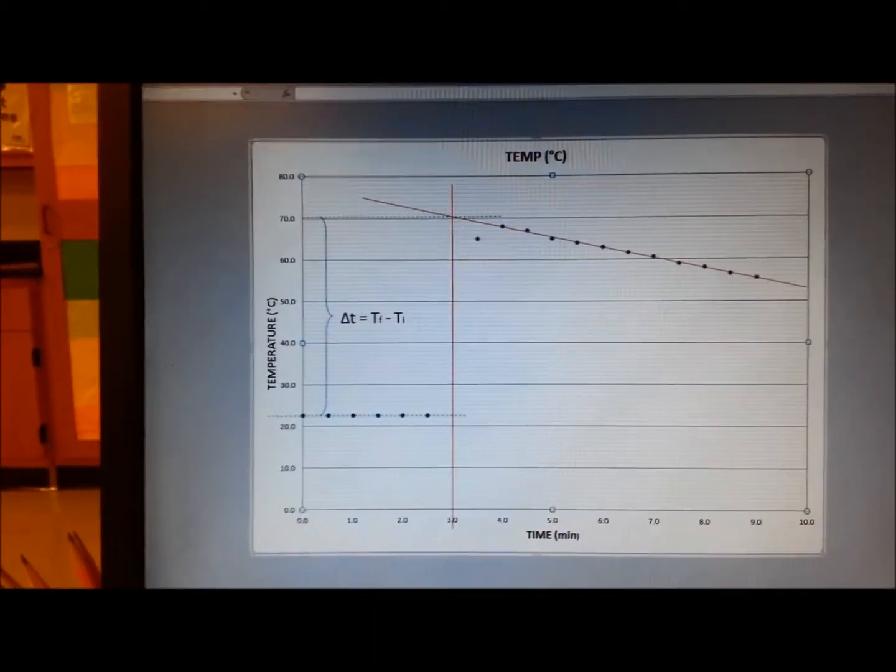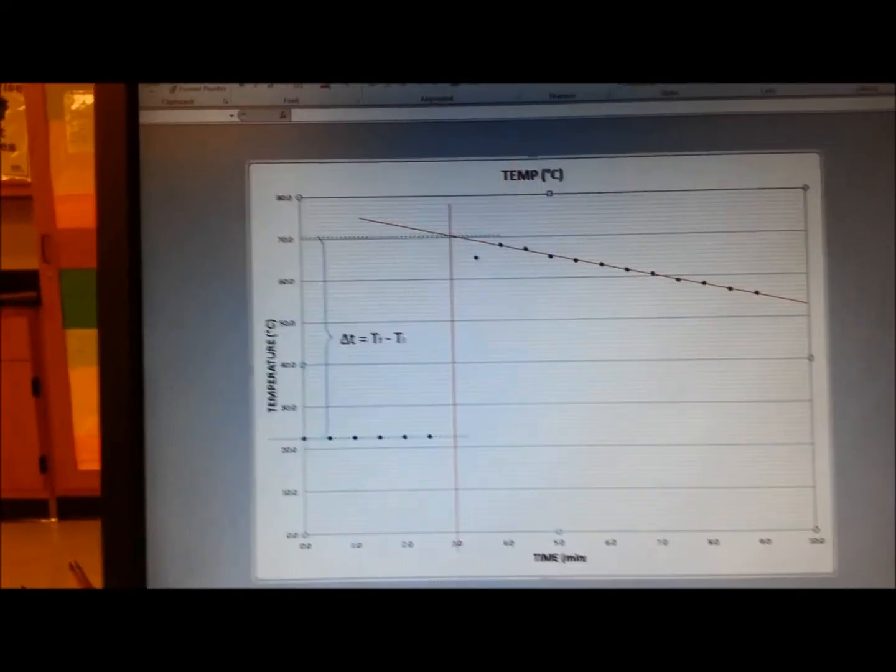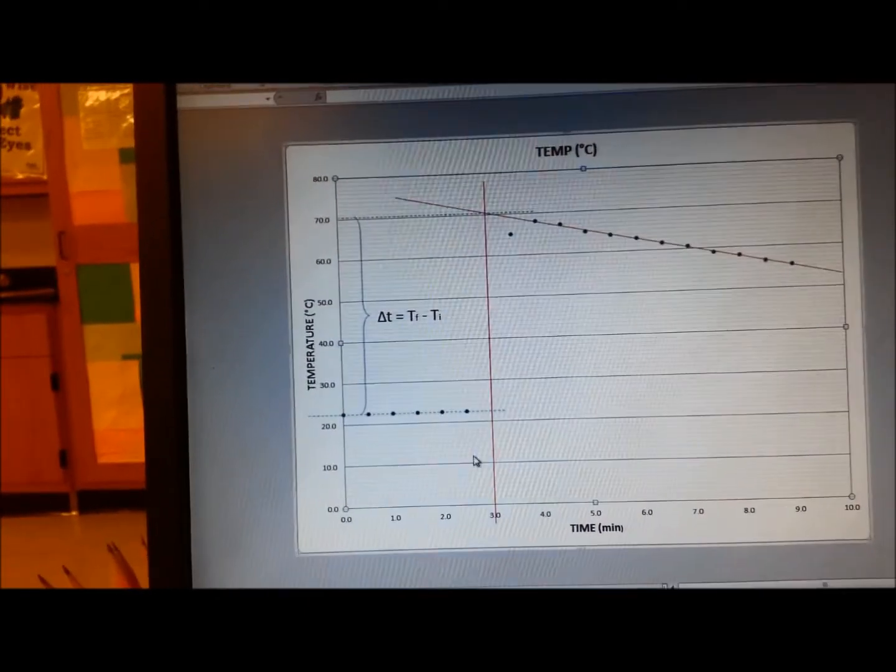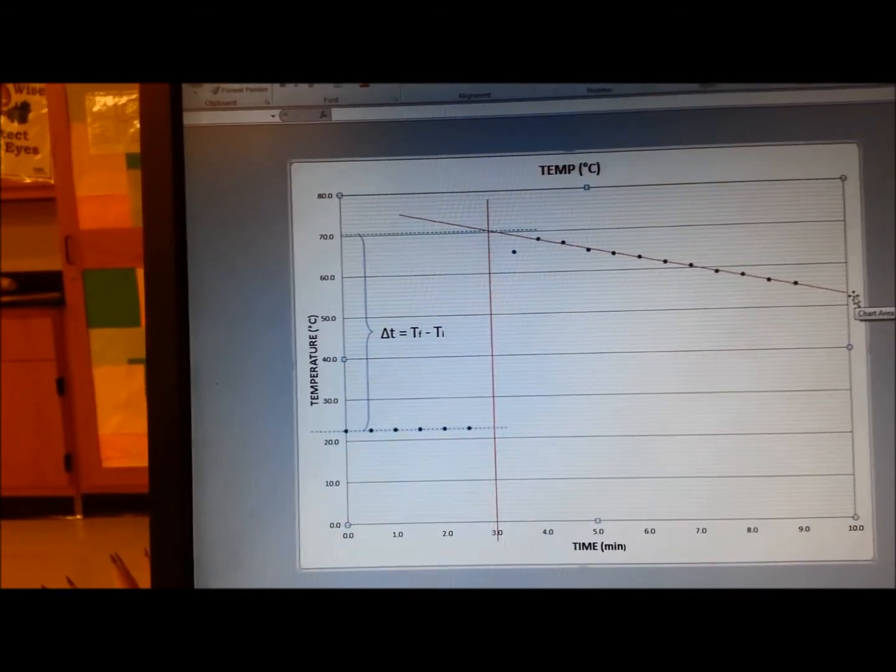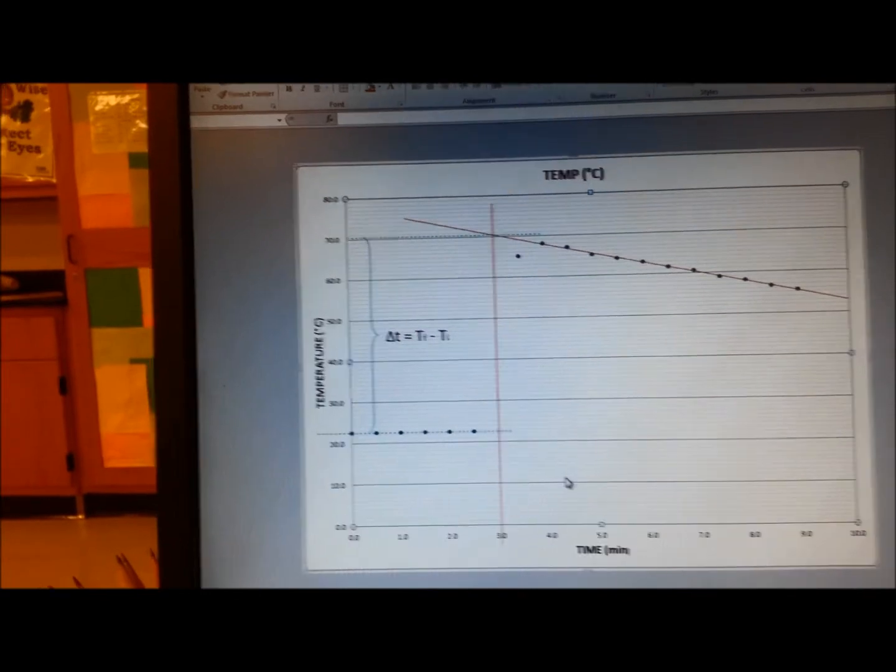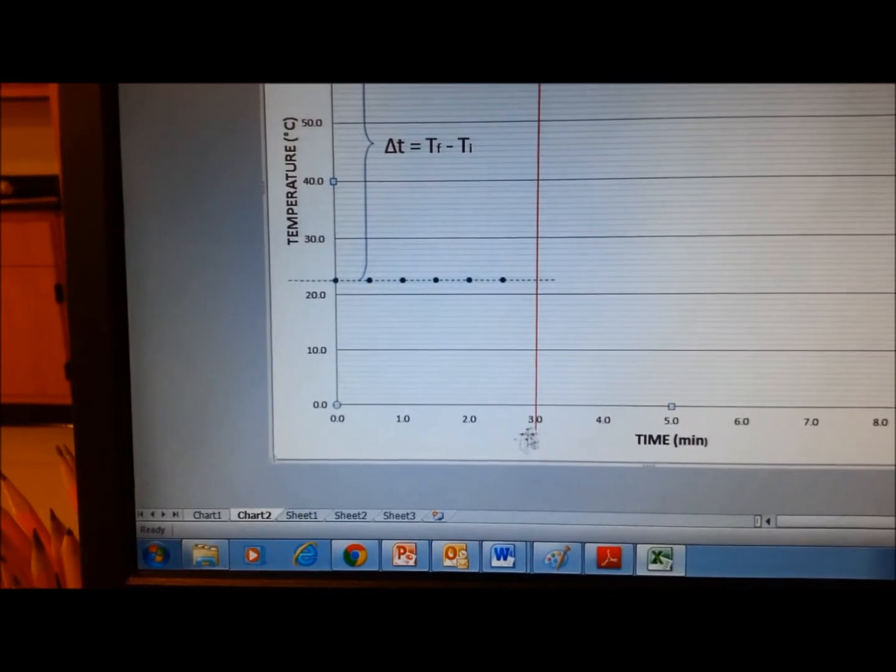After we develop the chart that is going to have only the dots, we put two red lines. One is going to be the best fit for this decrease in temperature after the maximum temperature was achieved, and the vertical at exactly three minutes.